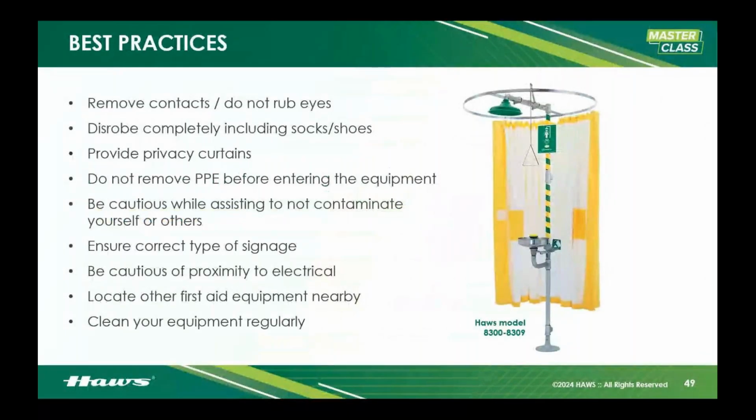Number one, remove your contacts. If you have contacts in, even if you risk cross-contamination, you have to get your contacts out. They will trap contaminants against your eyeball, or worst case scenario, as you hit the eye wash and put your face in it, it is going to flush that contact and the contaminants to the back of your eyeball, trapping them there. Get your contacts out. Don't rub your eyes if you can help it.